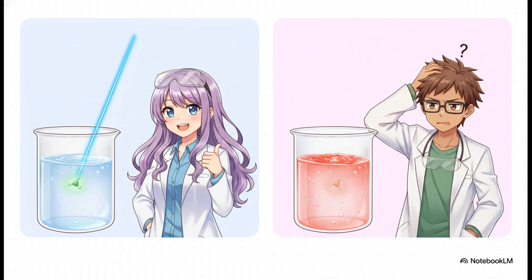Raman, on the other hand, detects changes in polarizability and just loves symmetric bonds, like carbon-carbon rings and aliphatic and aromatic compounds. But what's the absolute game changer here? Water. Water strongly absorbs mid-IR radiation, meaning IR struggles terribly with aqueous solutions. It's a mess. But remember earlier when we said water is a hard molecule? That makes it a terrible Raman scatterer. It is essentially invisible to the Raman laser. And that makes Raman the undisputed champion for monitoring reactions in aqueous media or complex biological samples.